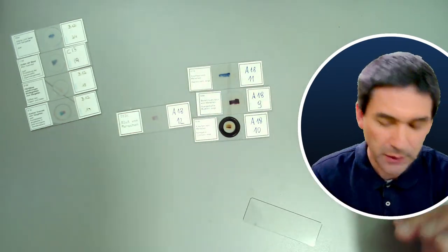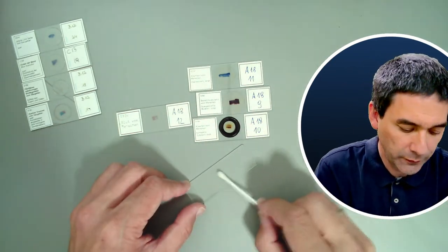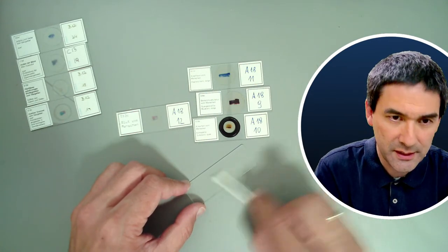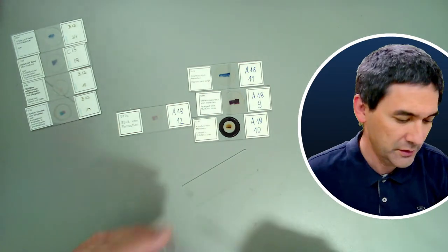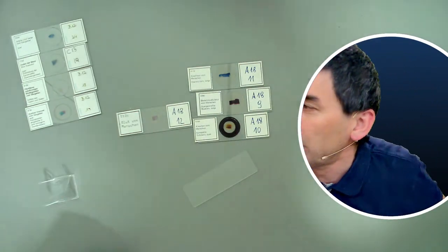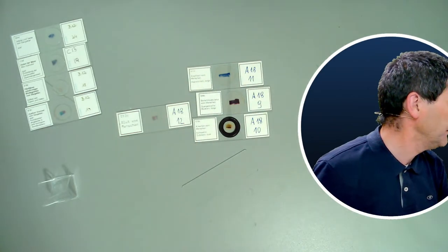Okay, so that's pretty much it. There are plenty of cells on here. Then you do the following: spread the cells on the slide. A cover glass wouldn't hurt. I cleaned up everything before, so here is a cover glass. The trash can is over there. And of course, we would like to have a little bit of water as well.